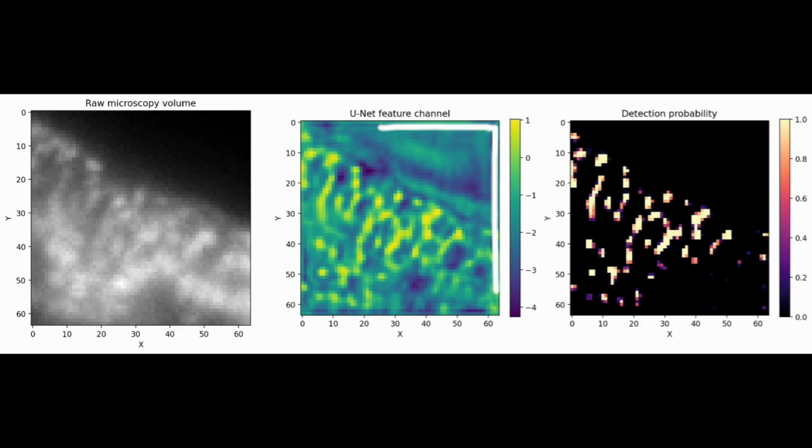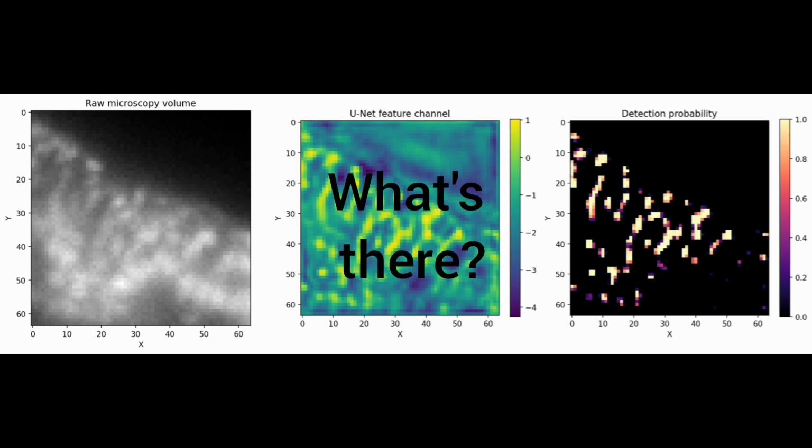The feature map is the model's representation of what it thinks the image or the video is. Very simply put, it is what the model thinks a cell is supposed to be. It is not just three dimensional in nature, it is multiple things, but this is a representation. On the right is a detection probability. That is the bunch of pixels the model thinks are the cell.